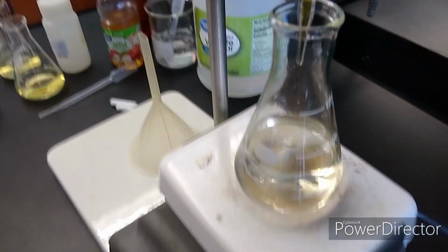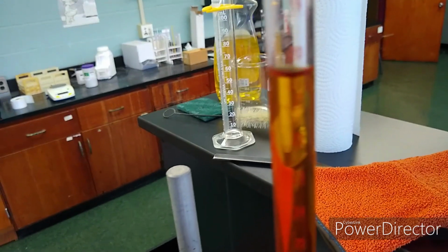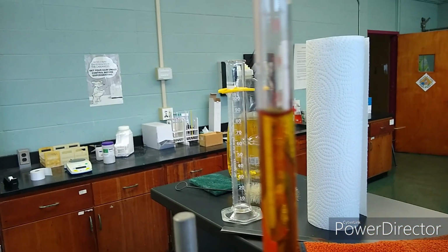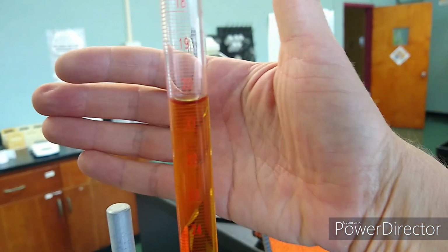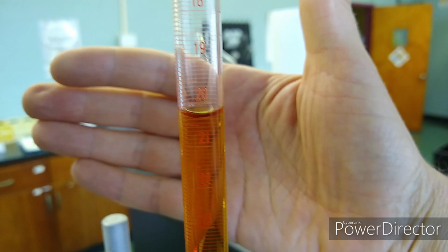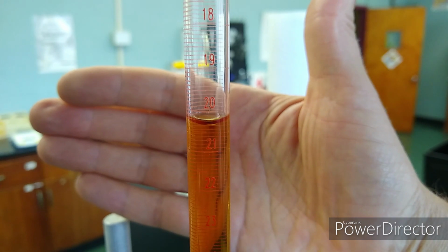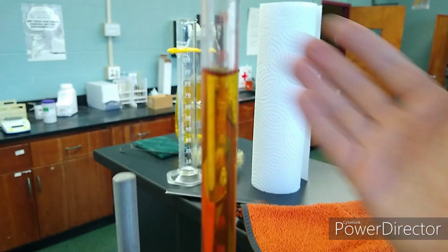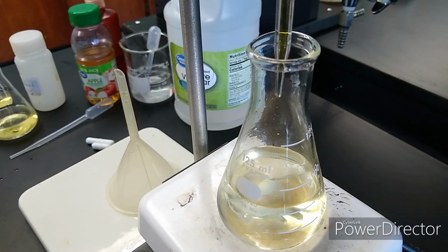What's the volume at? 20, focused. Oh, there we go. Ooh, there we go. Focus is good. 20.4. Man, that's hard to see still. 20.3. No, it's 20.4. There we go. One drop. Can I do it?